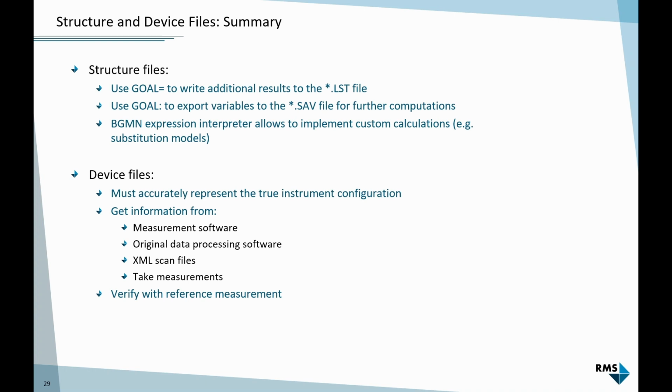And the second example will be an instrument configuration. I provided 2 files, 2 LaB6 scans, one on my instrument with the standard configuration and one with a modification. And we can try to create a second configuration for the modified setup. And then that will be the first lesson after the lunch break. And the second lesson, we will discuss some specific refinement challenges.